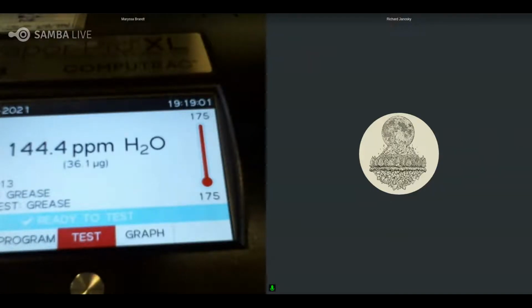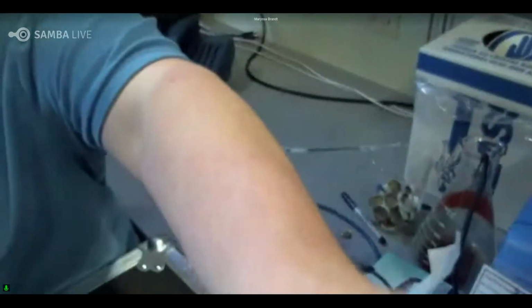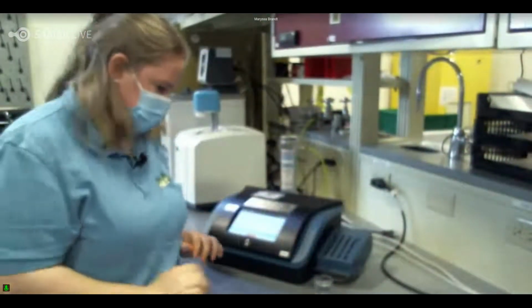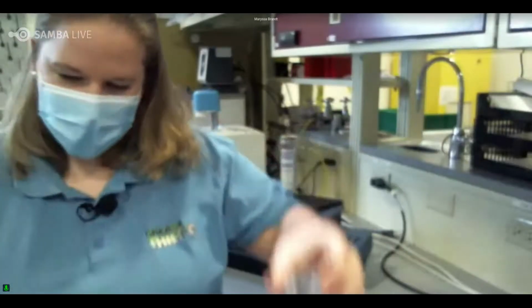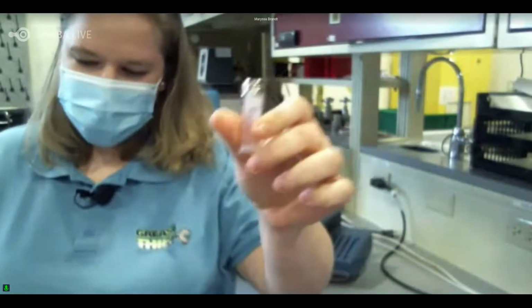Yeah, I can absolutely grab that. Let me just grab a beaker real quick and fill it with water, and I'd be happy to show that calibration process. So let me pop the camera back real quick. It's able to focus. Okay. So we have a beaker with water. It is labeled water. So we do have our beaker labeled with water, and we do have our micro caps.